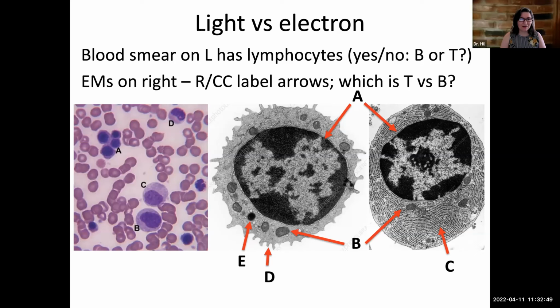Yeah, Nicole, the shape of it isn't perfectly smooth. It's got all these little blebs. Blebs as fingers, yeah, that's a good description. That's really what they are, reaching out to kind of feel stuff, to provide cell-to-cell contact for cellular-based immunity.